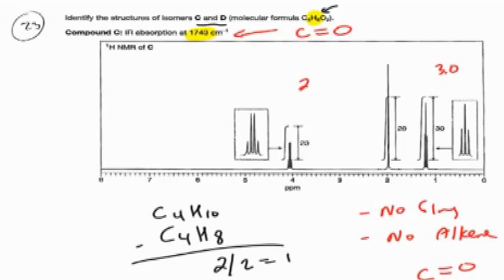I'm guessing that this is a 3 instead of 2.9, right? So divide by 10, you get 2.3, but then I'll just say 2. And now let's see if we're right. So this right here we could just say is 3. And so we have 3, 2, 3, and that's how many H's we're supposed to have. So I know now that I've figured out my H count for each chemical shift.